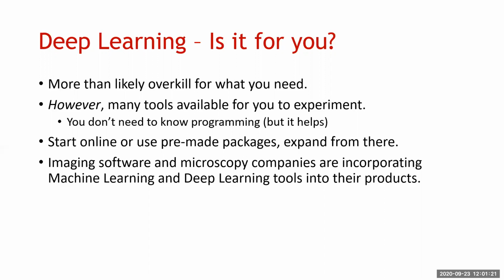Yeah, start online, use the pre-made packages and the pre-made bundled models, and then you go from there. And the good news is, as we've already seen, that a lot of the imaging companies, software companies, microscopy companies are already including machine learning and deep learning tools into their packages. So there will be a time where you will sit there and you're just running an example. In fact, Nikon has one where you just run denoise AI straight away, and you can denoise your resonant images right there. So I mean, it's already happening. So it's not something that is too complicated if they make it a way that is more intuitive.